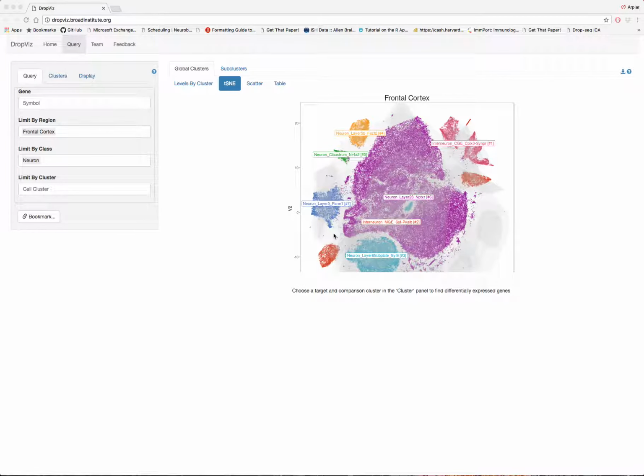Hi there. In this tutorial video, I'm going to show you how to use differential expression analysis through the scatter feature of DropViz to identify markers both at the level of global clusters and at the level of subclusters. For this tutorial, we're going to focus on the frontal cortex dataset and class neurons within the frontal cortex dataset, which I've loaded here.